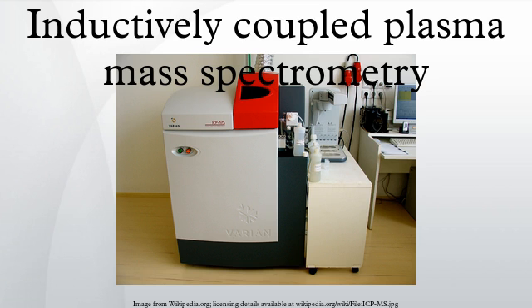Less commonly, laser ablation has been used as a means of sample introduction. In this method, a laser is focused on the sample and creates a plume of ablated material which can be swept into the plasma. This is particularly useful for solid samples, though it can be difficult to create standards, leading to challenges in quantitative analysis.